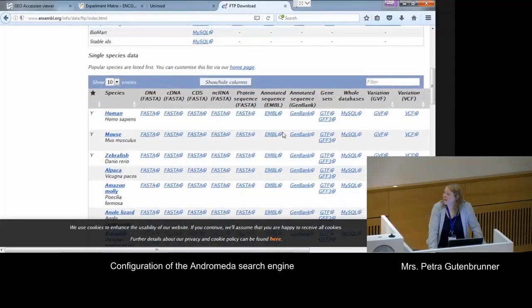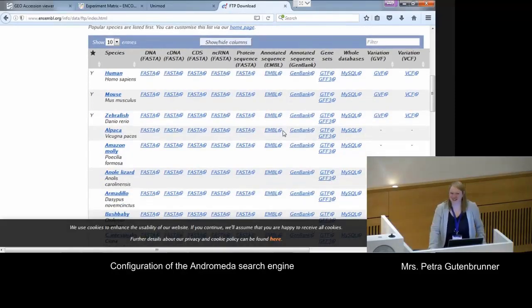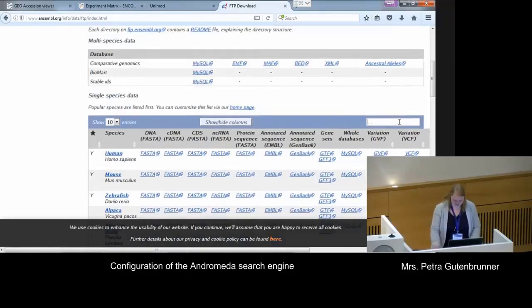Okay, I will insert my password. Oh, amazing. Okay, so I'm lucky here it's still working. But just So, something, okay, and I'm already at the point where we see the I will insert my credentials. important information.